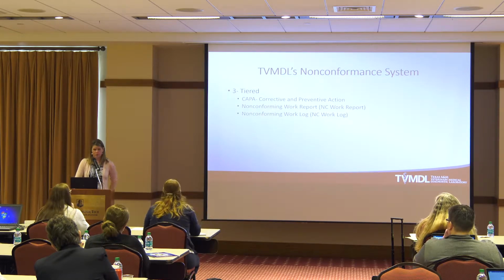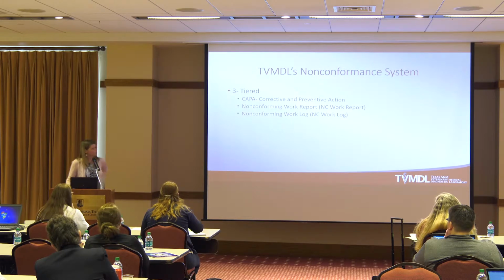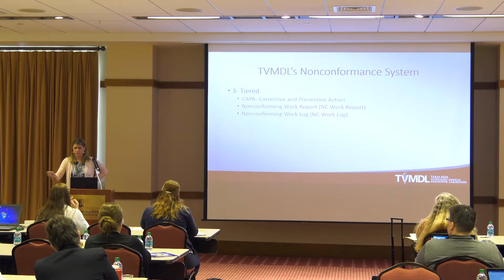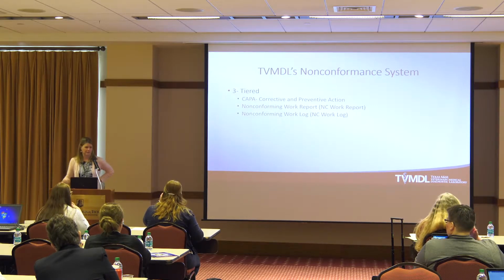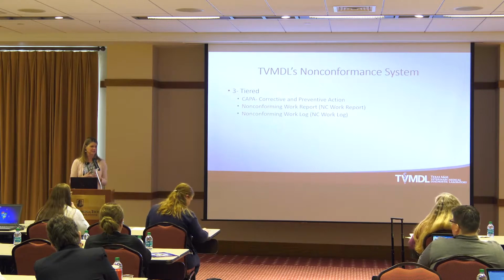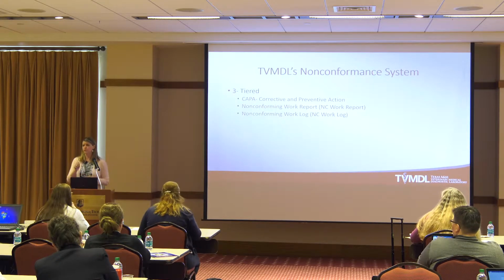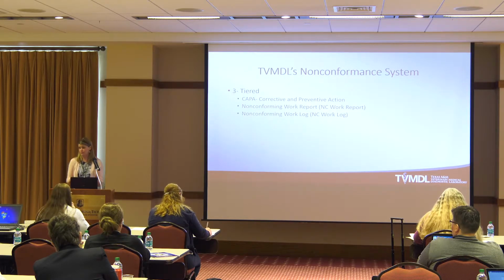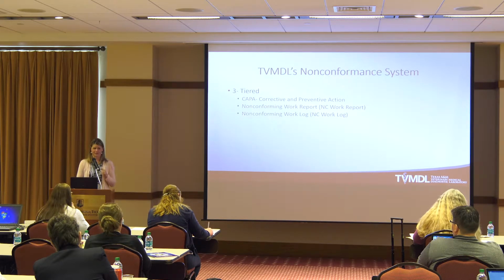The non-conforming work log is our only tier that is not actually a workflow. The document is, but it's a log, and they just keep that at their lab bench, and they can write on that, or we have an electronic version. The sections have said, we don't want that as a workflow. We just want to jot that down in real time if we need to. So we have that option as well. But we don't consider that, and haven't defined that in our procedure, as a way to address a corrective action.